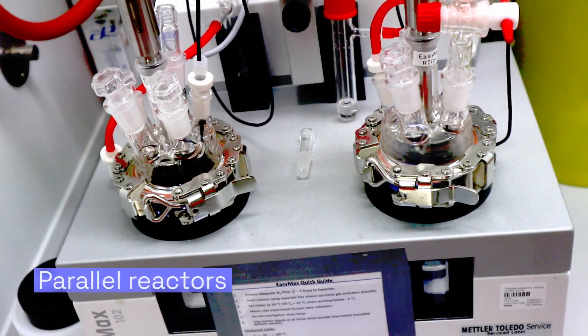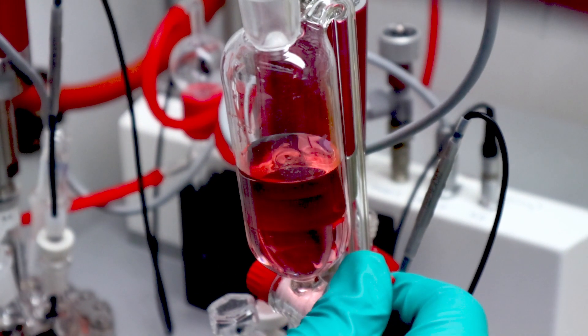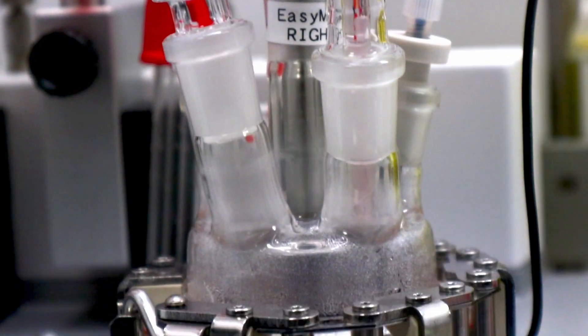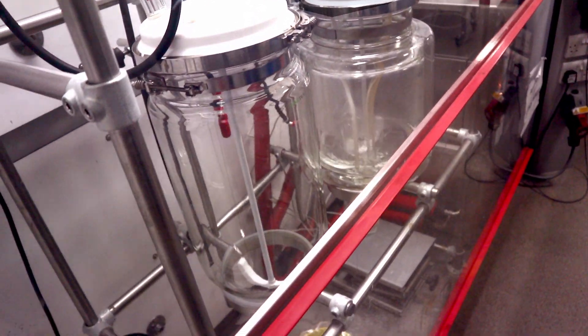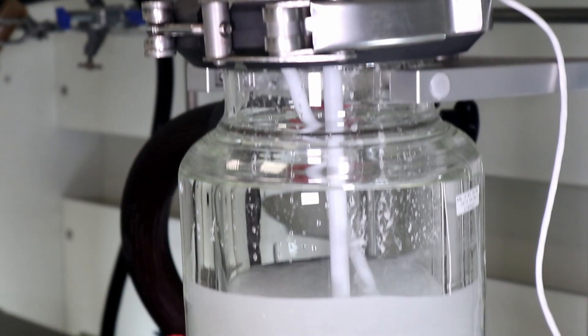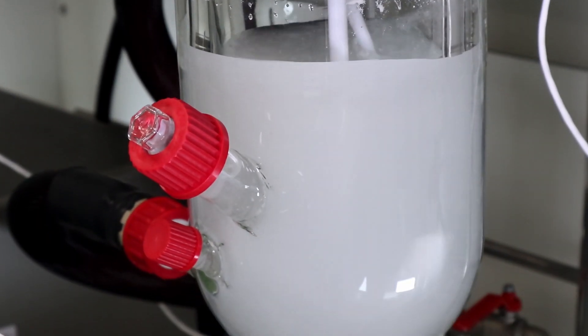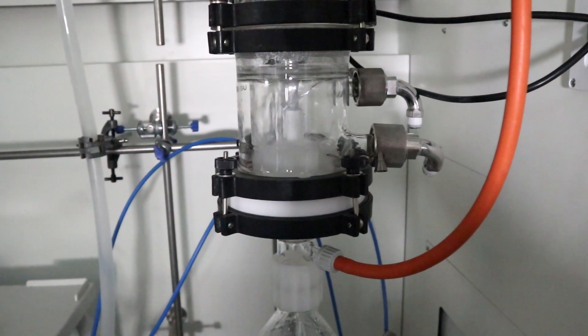Our chemical development begins with either development of an existing route or a scouting exercise to identify a new synthetic route. Our goal is to identify and develop a route of synthesis that is safe, economical, and practical for manufacture at large scale. Where possible, we replace operations that are not suitable at large scale, such as chromatography, with crystallization-based isolation and purification.